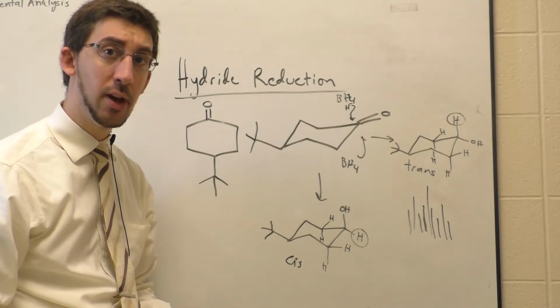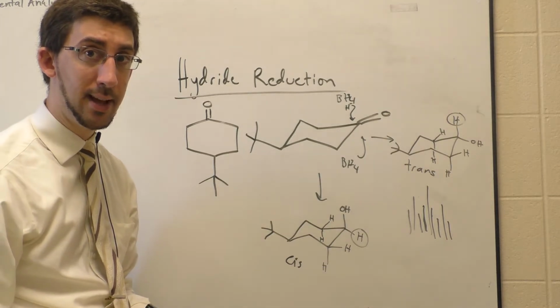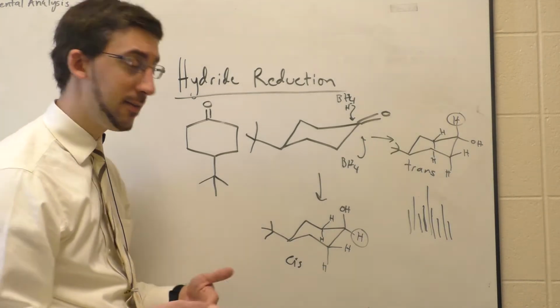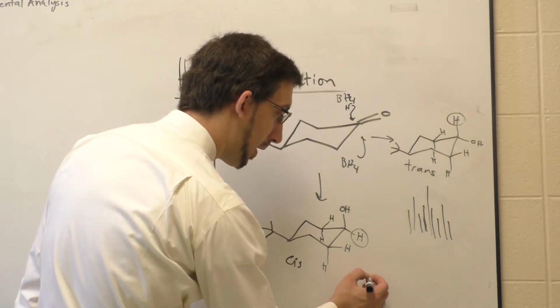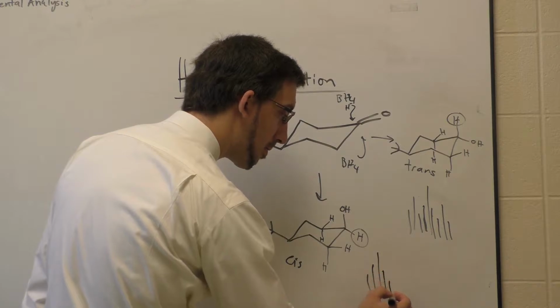which means that all 4 of the neighboring hydrogens couple with about the same coupling constant. And so we essentially just treat this as having 4 neighbors. So I end up simply with a 5 splitting pattern. So 1, 2, 3, 4, 5.